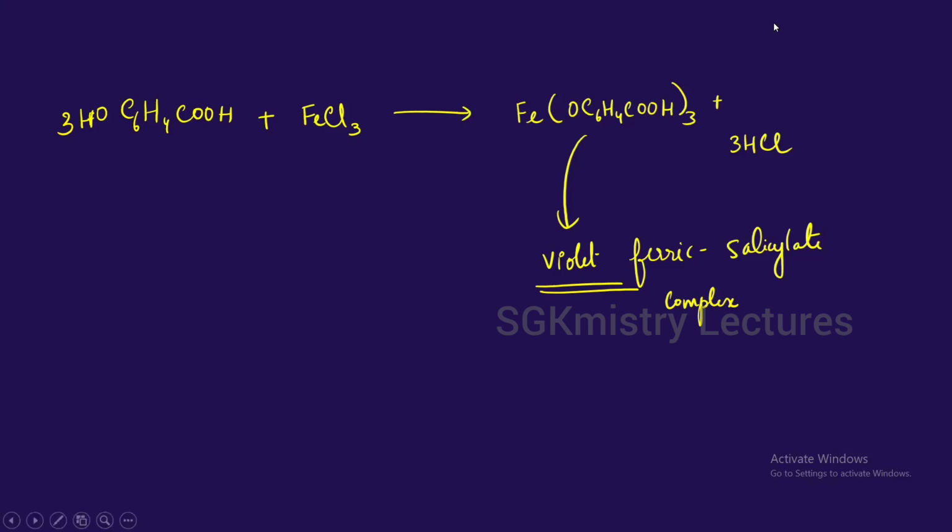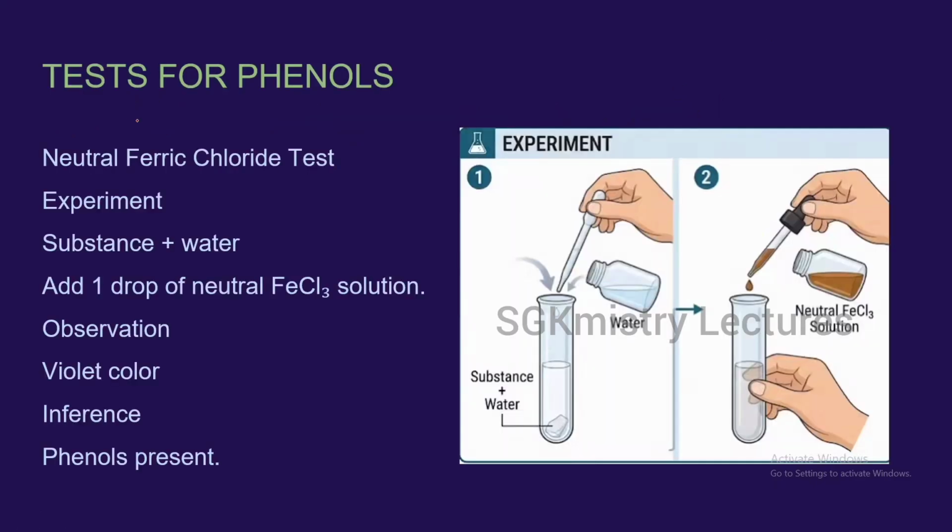Right. So next, coming on to the test for phenol. As we already know, under group 4, there can be acids, that is carboxylic acids, or phenols that may be given. So the first test, which is common, is sodium bicarbonate, which you're going to add. When sodium bicarbonate solution is added, if there is no effervescence, then you directly decide that the given compound is a phenol because we're testing for group 4, right?